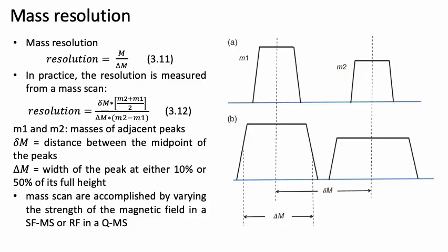But what I'll have you do in the homework is simply use the first equation, and you can calculate a rough mass separation by just considering the differences between the masses. I have you do this for uranium and also for 87 rubidium and 87 strontium. You can calculate roughly what kind of resolution you would need to actually analyze those isotopes in a mass spectrometer, and you'll see how different it is for the two different examples.